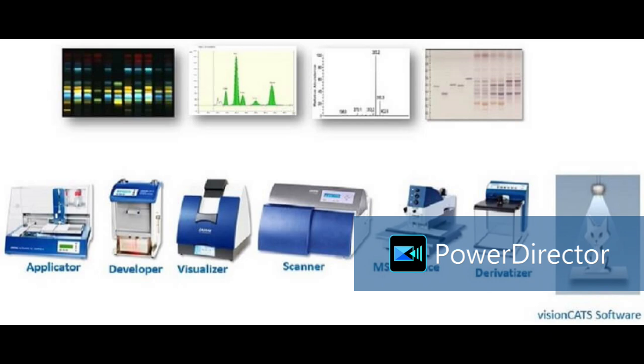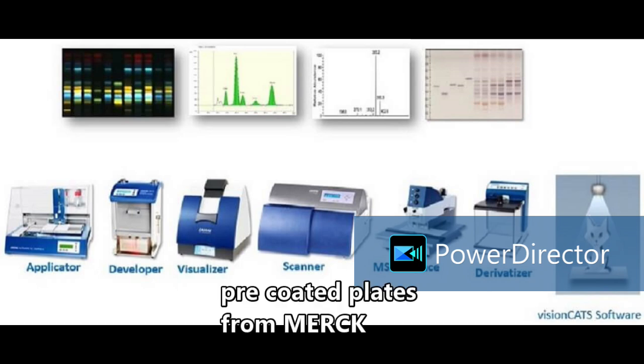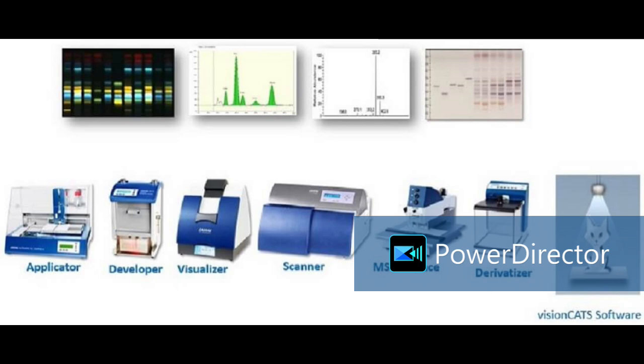No, we are using pre-coated plates from Merck. Merck is the key manufacturer across the world. You can see Merck is everywhere. Nearly 90% of the plate materials they are manufacturing. Macherey-Nagel and many other manufacturers are also there. But we are using Merck manufactured TLC and HPTLC pre-coated plates, and more than 50 different types of plates are available.